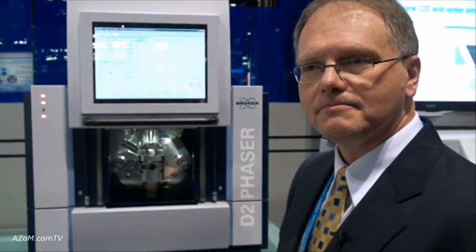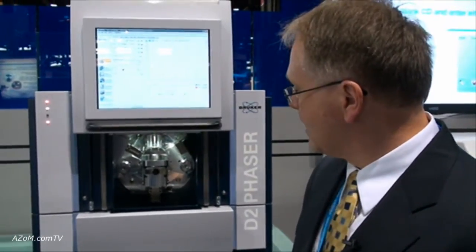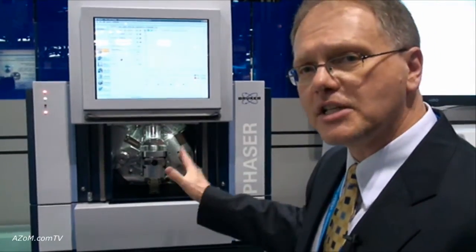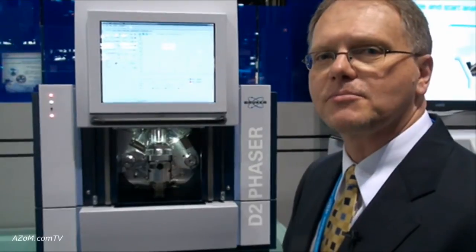Presumably it's a fair bit cheaper than the floor-standing models? Considerably. It is a limitation of the system — it is a phase ID system and does not come with options like temperature stages that we would have on our research systems. However, it has a very nice price point, with the scintillation detector starting at $76,000. So a good device for quality control applications and things like that? Perfect for those kinds of applications.